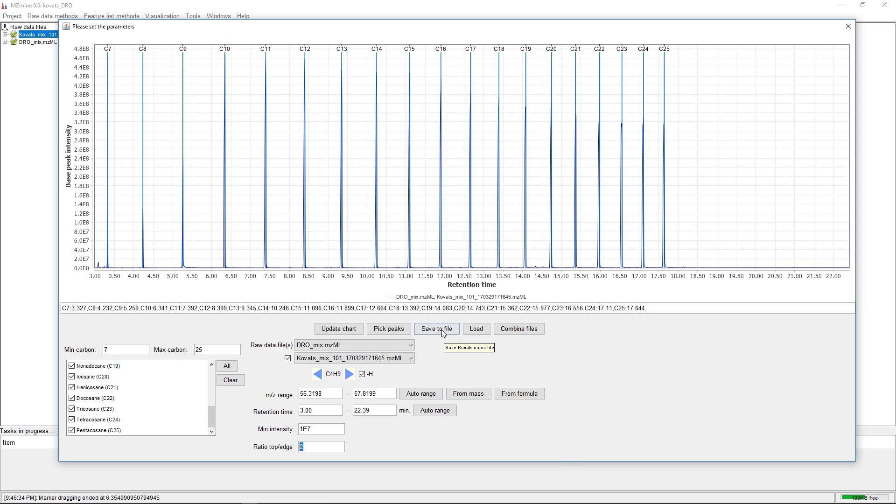After picking all these retention times, we can save them to a file. This file is provided to the GC-MS workflow on GNPS.